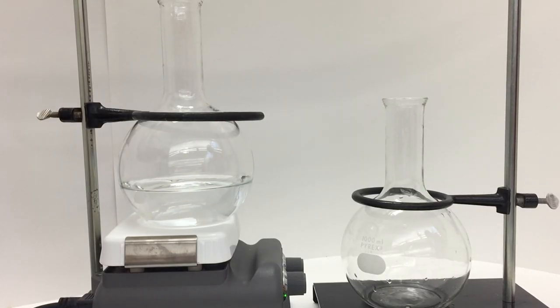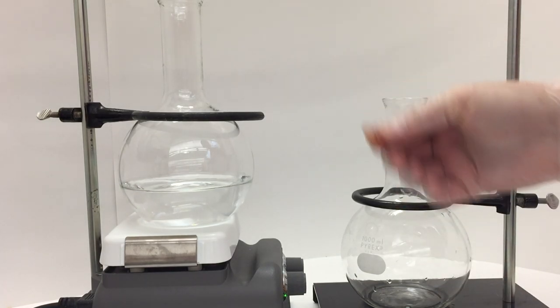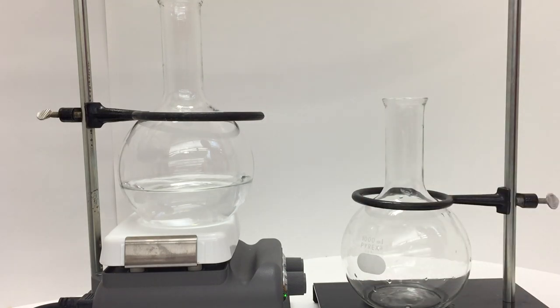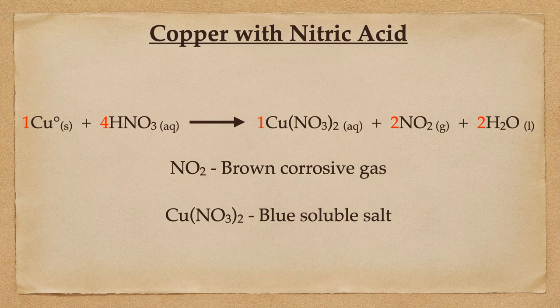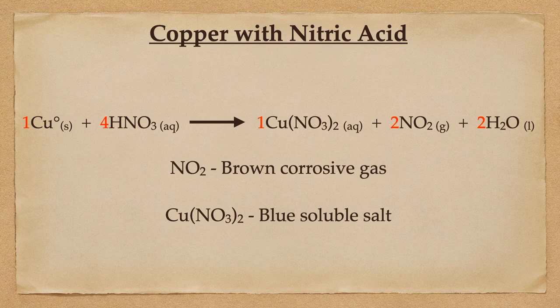Today we're going to react some concentrated nitric acid with some copper pennies - I have a Canadian penny and a eurocent - and demonstrate that the brown nitrogen dioxide gas that is given off is very corrosive and in fact very acidic itself.